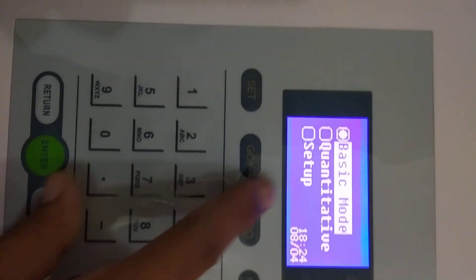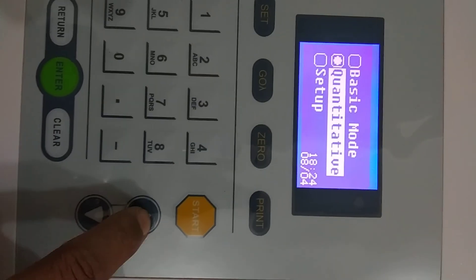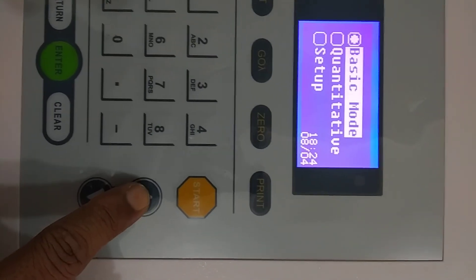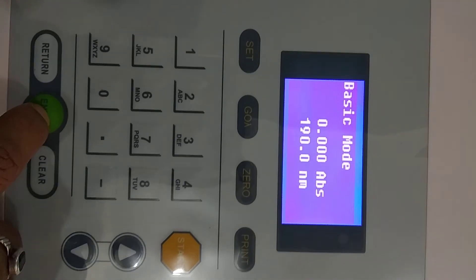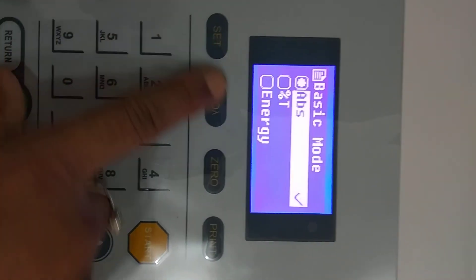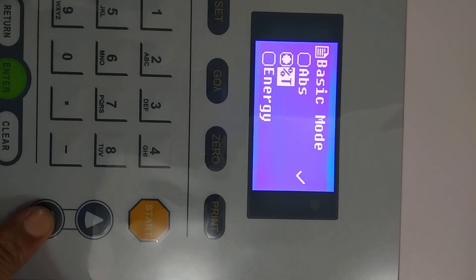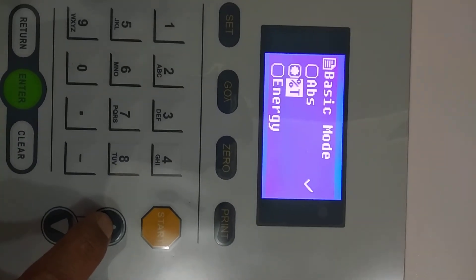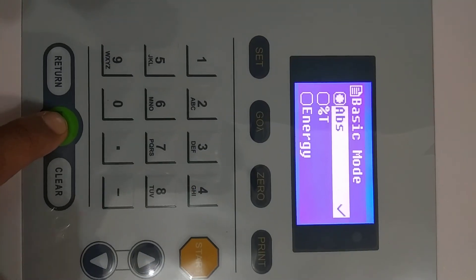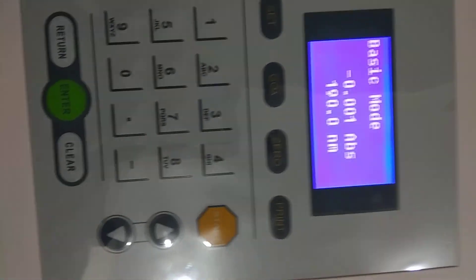After warm-up, this is your main menu. Go to Basic Mode — use the up and down keys to change modes. In Basic Mode, press Enter, then press the Set key for mode selection: choose what you want to measure — absorbance, transmission, or energy. Click on the icon and press Enter, then press Return.